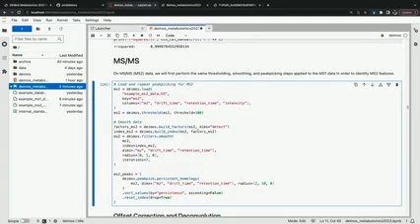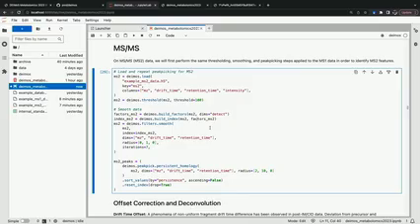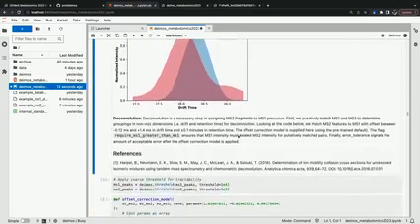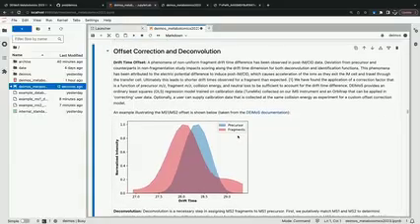Okay. And then once you have your CCS calibrated, the data that we've included here also has fragmentation data, MSMS. And so we'll perform the same thresholding, smoothing, and peak picking on the MS2 data here. And while that runs, do you want to go through the offset part?